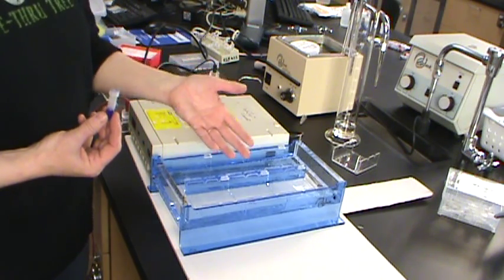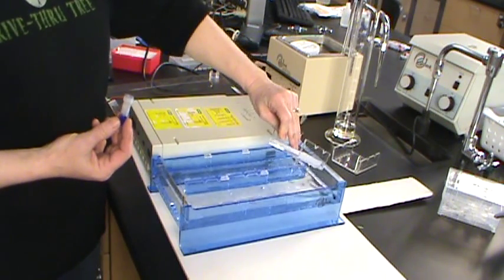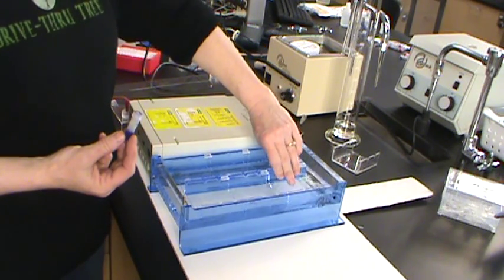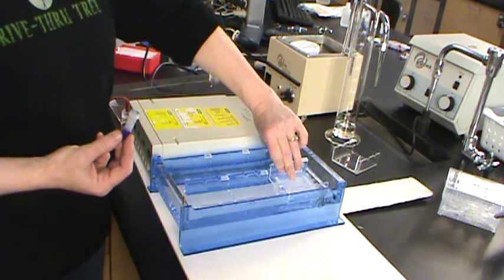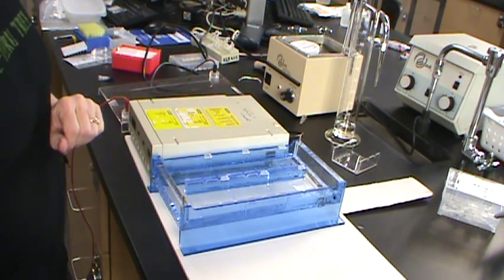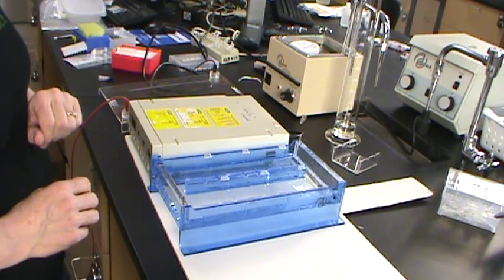And then you'll just take that gel out and we'll throw those away and we'll put in the good gel for our samples. Unless it still looks pretty good, then we may just rinse it out and use that one for your actual electrophoresis. But we'll do some sample loading while you are waiting for your incubation.